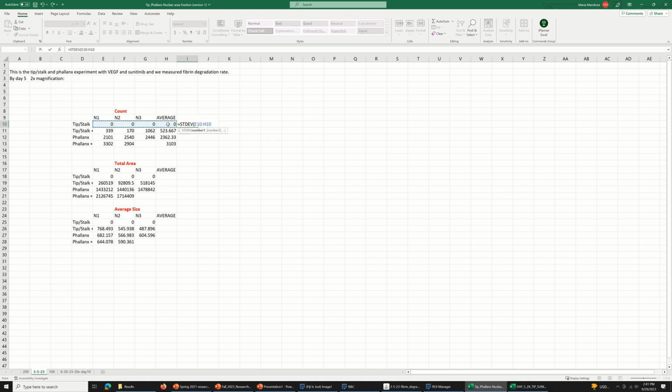So it's gonna go here. Oh, just the first 3. Okay, and then we'll take it down. Okay, and then here we're gonna say equals D standard deviation, this one, the normal one. Okay. And then we're going to do the same for all these right here.